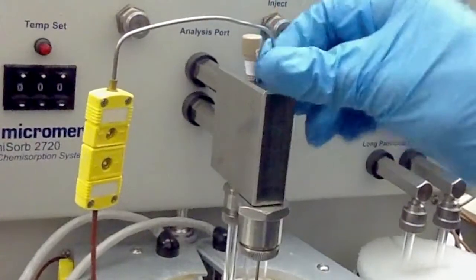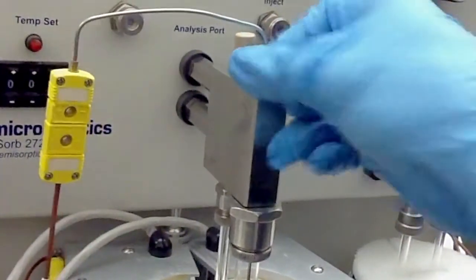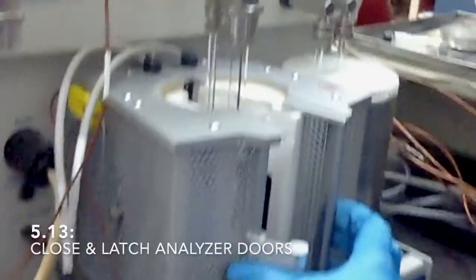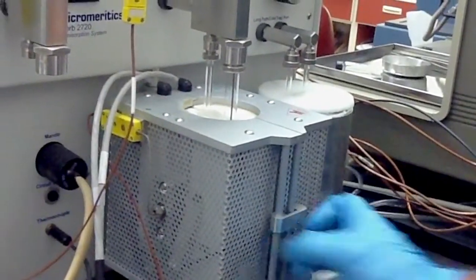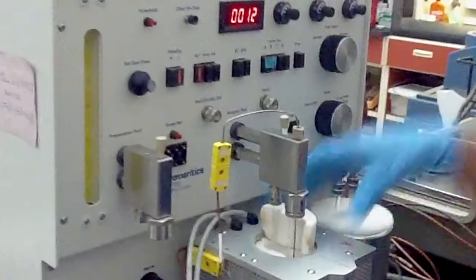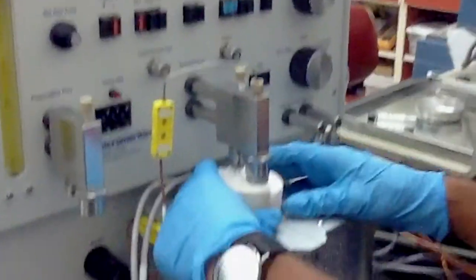That's it. And close this one. This furnace is closed now. Take the insulator, which you kept here, and also put it back, both parts.